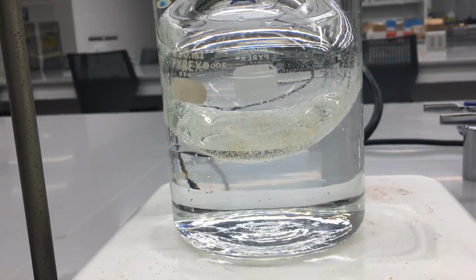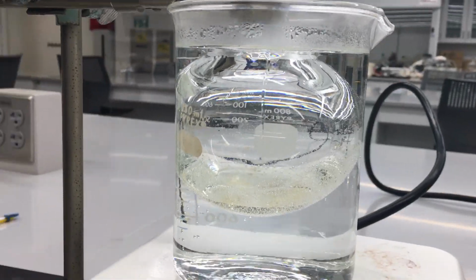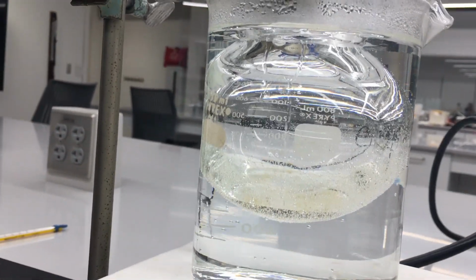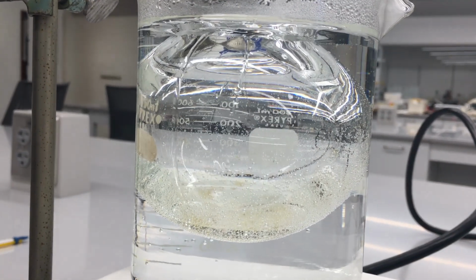All right, so as we let the water boil, you can see that the inside of that round bottom flask has some of our liquid being vaporized and being condensed back down. You can see the streaks and the marks coming down there.